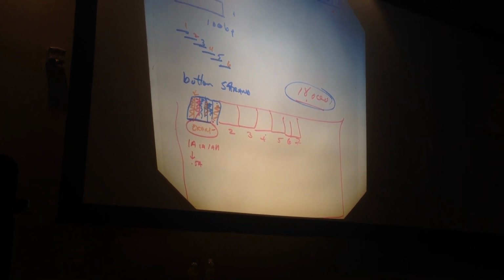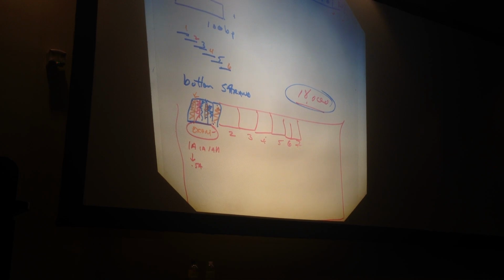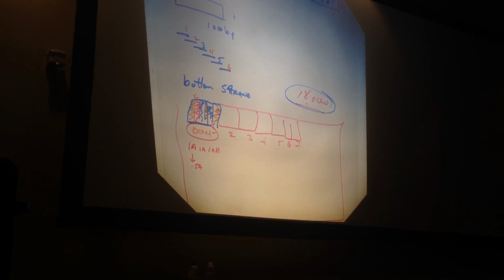That's right. And in these chips, there are oligos, and there are oligos for each part of each exon. Within each exon, yes. So we can tell by using this whether an exon is real by whether it all binds or some of it binds. That's right.